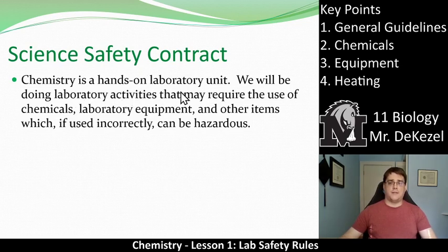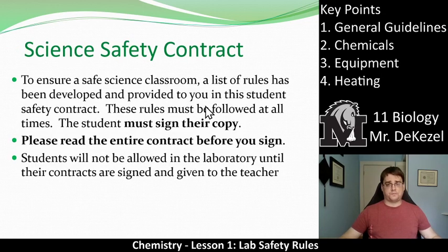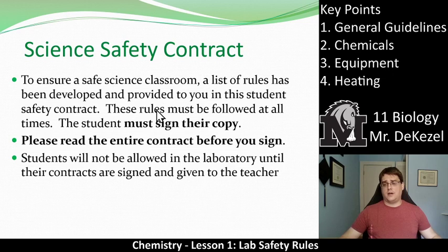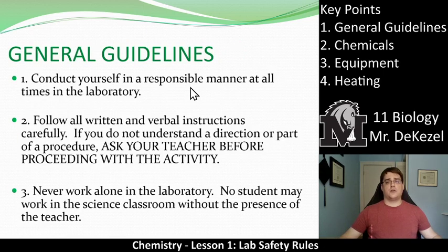At the bottom you're going to sign the contract — it's a contract with me that says you understand these rules and you're going to do your best to follow them at all times. So if there are any accidents and you say you don't know some rules, we'll go back and talk about what rule might have prevented that accident. Chemistry is a hands-on laboratory unit involving chemicals, lab equipment, and items which if used incorrectly can be hazardous, such as Bunsen burners or matches. Students will not be allowed in the laboratory unless their contracts are signed and given to me.